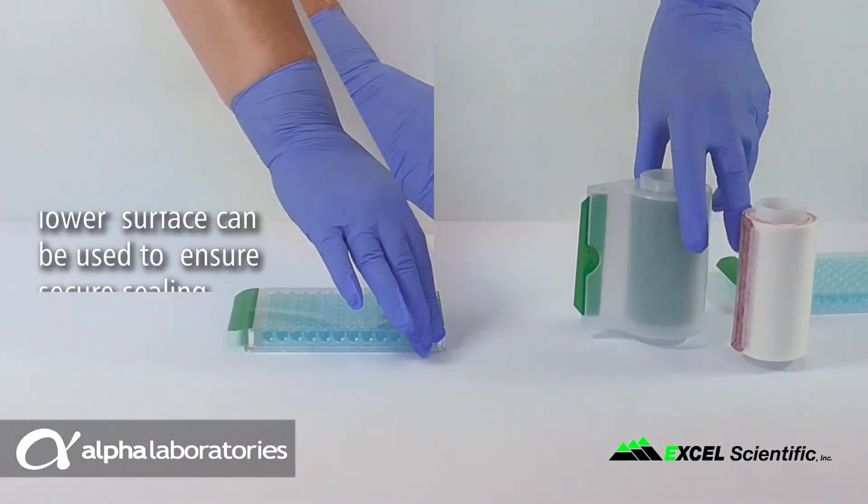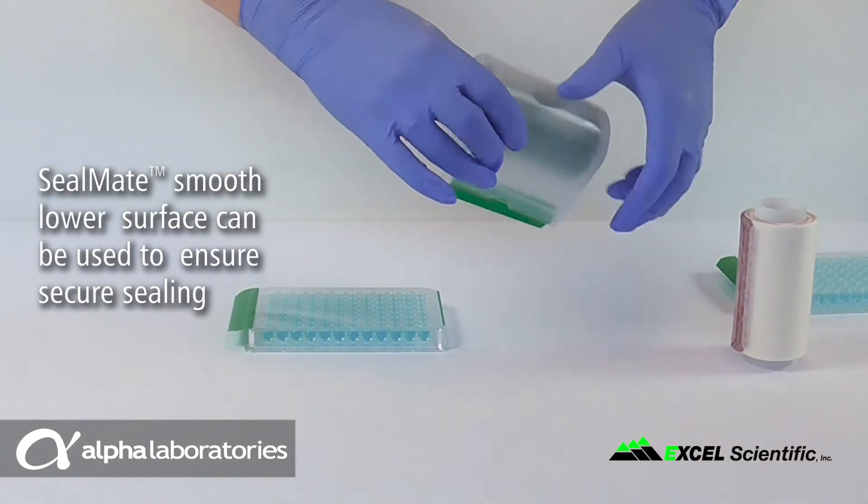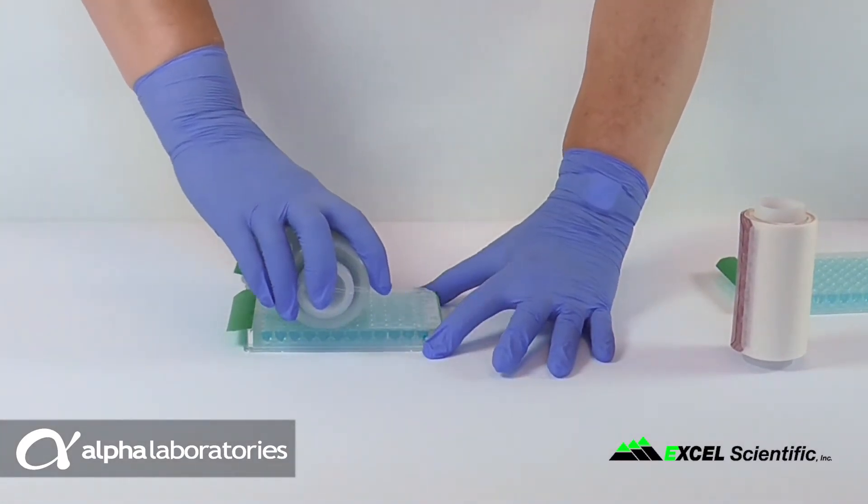The smooth lower surface of the SealMate can be swept across the film once applied to the plate to ensure secure sealing around all wells.